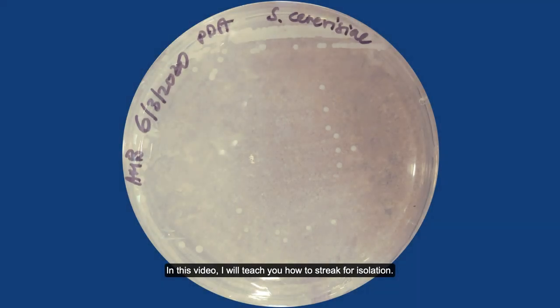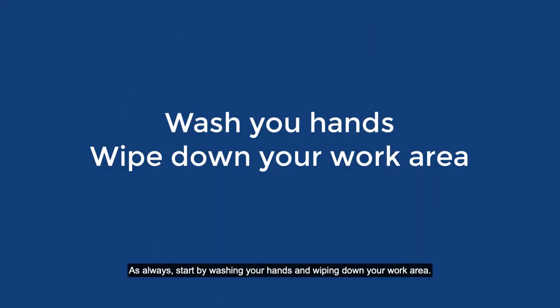In this video, I will teach you how to streak for isolation. As always, start by washing your hands and wiping down your work area.